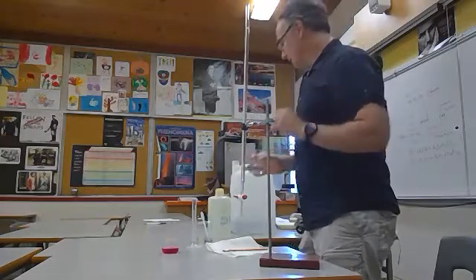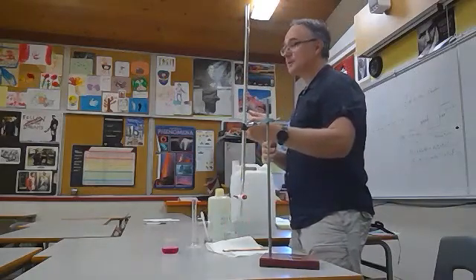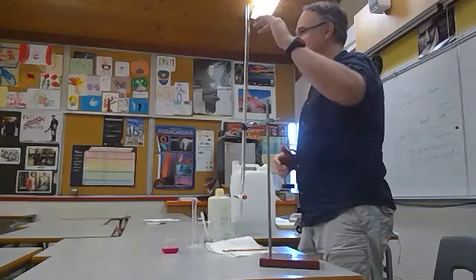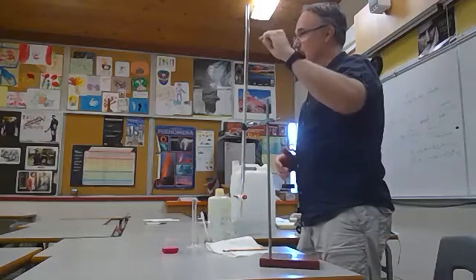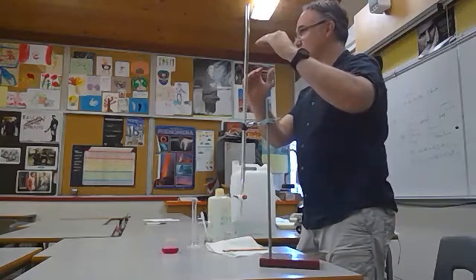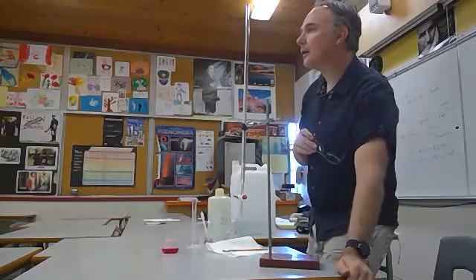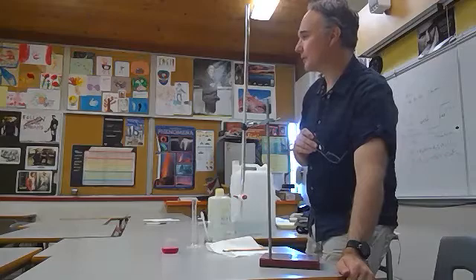I'm going to give you some numbers to write down here to help us do a calculation. Right now, when I fill this up, I want to make sure I don't go past the 0 mark. There are all these calibrations on here. It's not really important to get to 0. I just have to record the starting number and then the finishing number, and subtract them to find out how much chemical I actually have. So right now, when I'm reading this, there's 0.4 milliliters as our starting point.